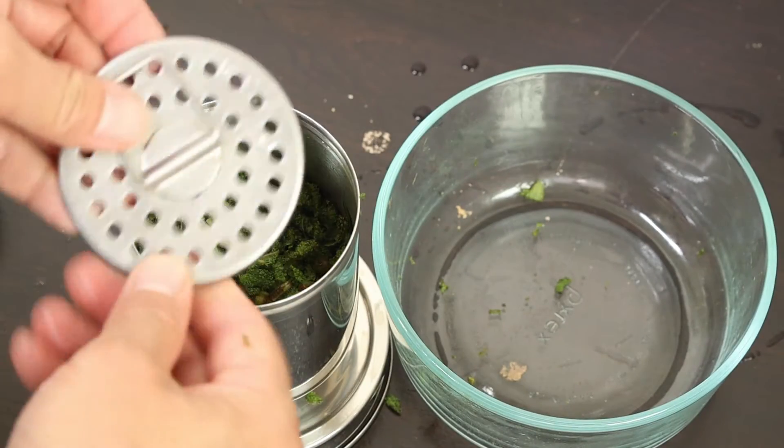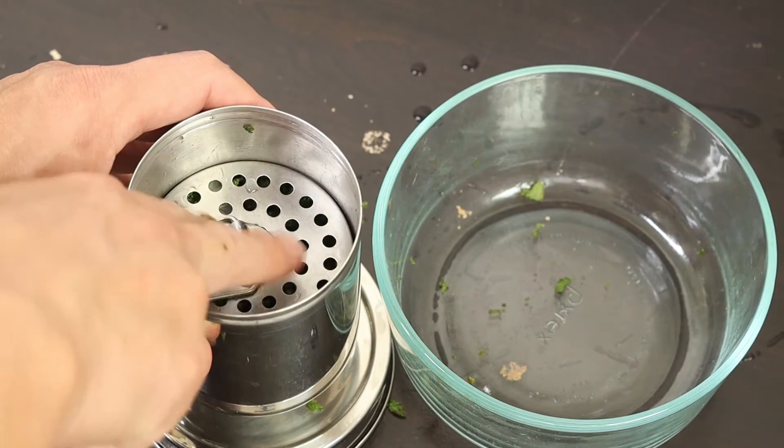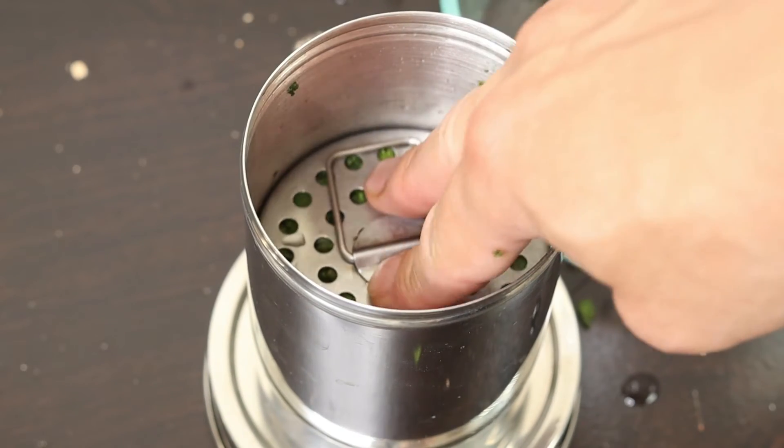The benefit of the KD5 is that you have a top sieve. After you have the sieve in, press it down — this will be perfect.